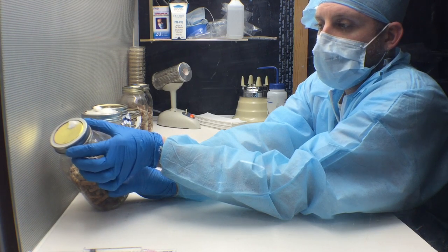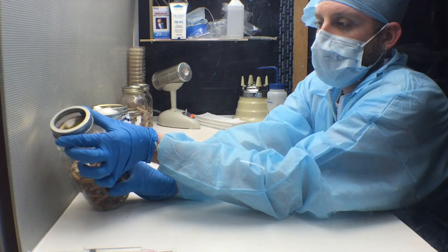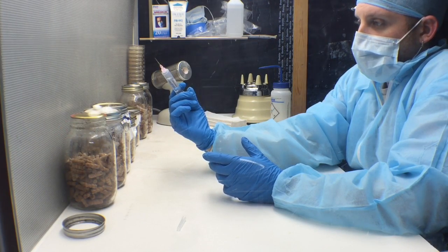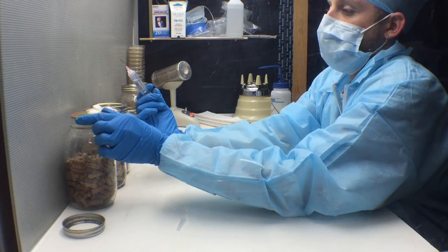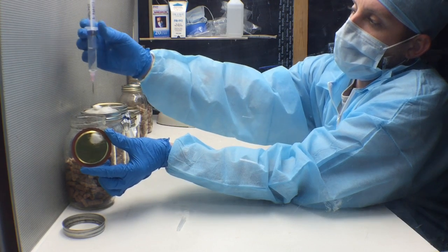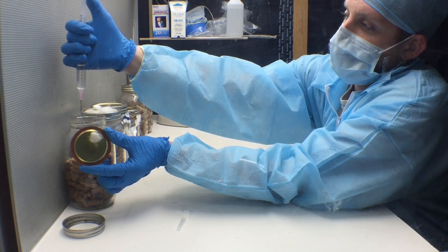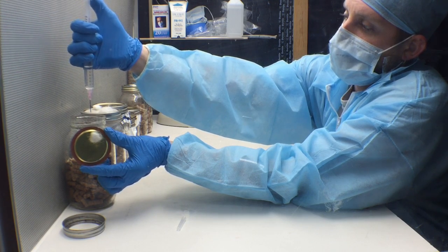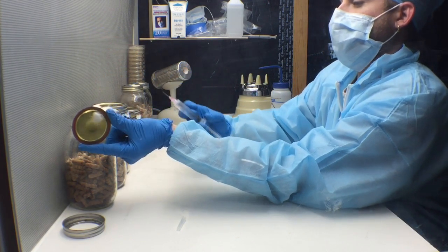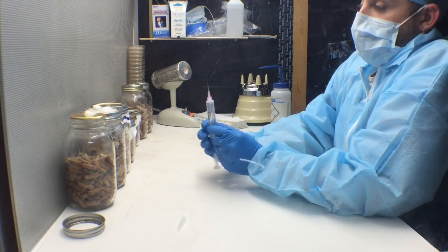Unscrew the lid and take off the top ring, just leaving the cap on top of the jar. Once your jar is ready for inoculation, carefully lift off the lid with your left hand, keeping it in front of the flow hood. Take your syringe and start squeezing your liquid culture onto the dowels. Once you've put your desired amount, take the lid and carefully place it back onto the jar, keeping your hand behind the jar at all times.